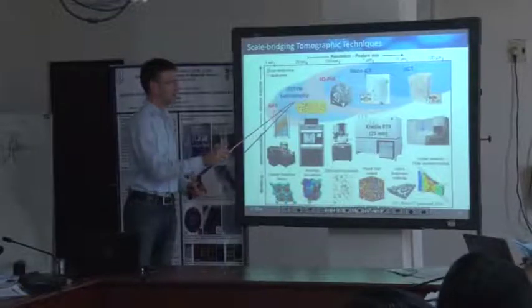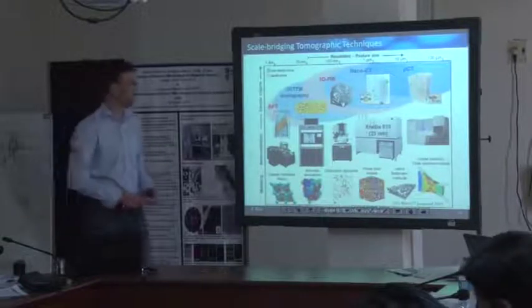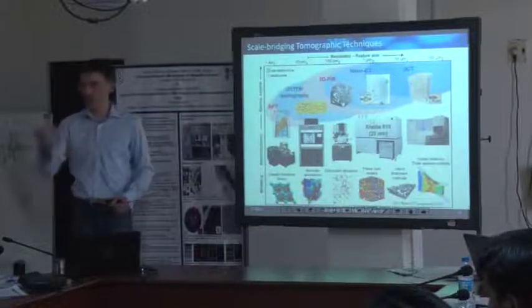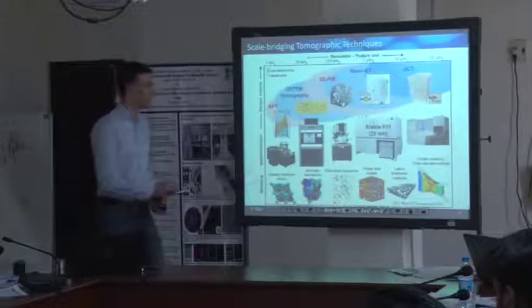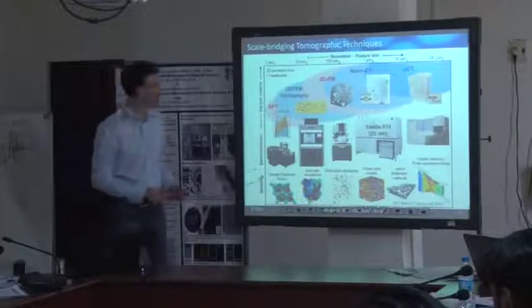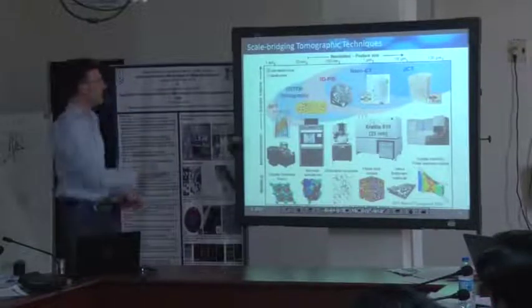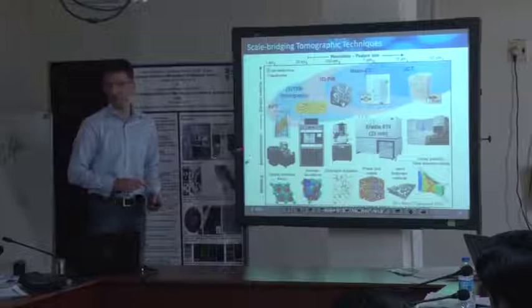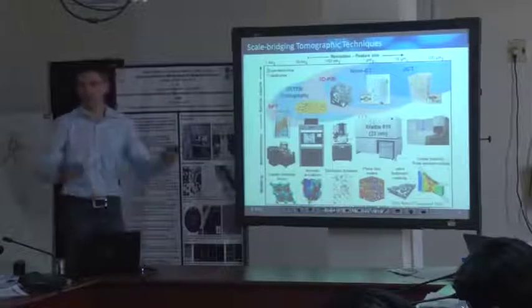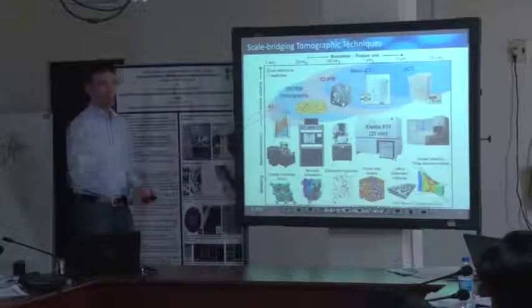Scanning and transmission electron microscopy tomography is non-destructive after preparing our TEM sample, but the TEM sample remains. FIB tomography, on the other hand, just removes material, so this is destructive. Okay, by that, I mean you can cover all the different length scales by tomographic techniques. We can do 3D analysis on all those different length scales, meaning that there are even correlated microscopy projects where we start at high magnification, if you just think about crack propagation in an alloy or so, and then finally you go down, probably to the atom probe.